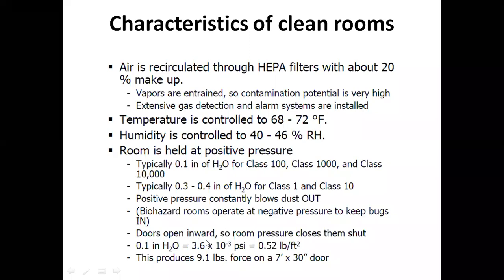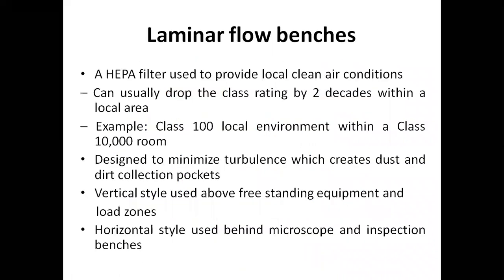Doors open inward, so room pressure closes them shut. 0.1 inch H2O: 0.1 inch of water is 3.6 × 10^-3 psi, or 0.52 pounds per square foot. This produces 9.1 pounds force on a 7 foot by 30-inch door.